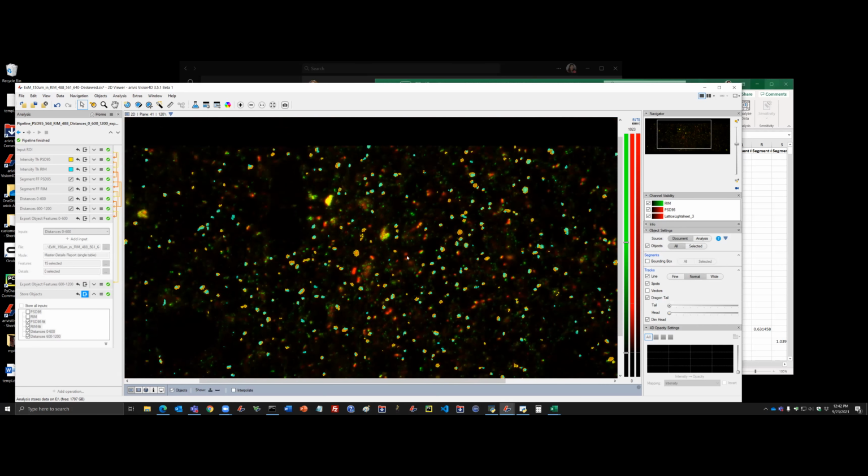The script divides this skeleton structure into individual branches for which we can quantify the generation number and their length, their real and linear length, so that we can do the tortuosity measure as well. I hope that answers the first question.